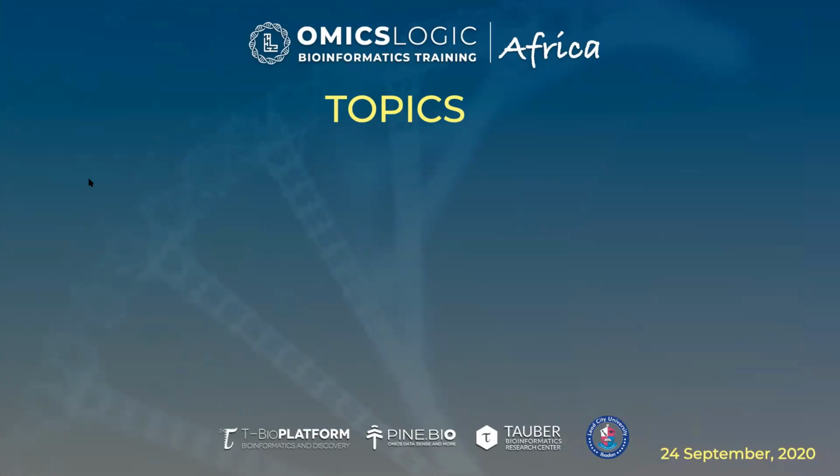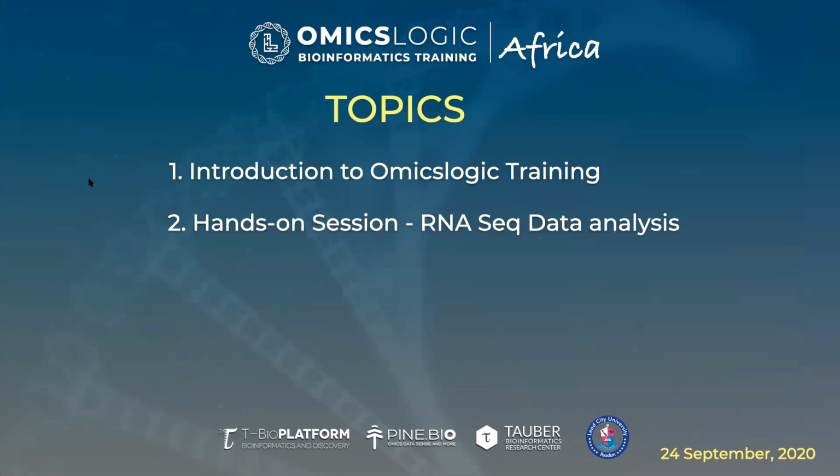So today we'll discuss the following topics. First of all, we'll talk a little bit about the OmicsLogic resources and different training platforms that will introduce you to bioinformatics. We'll also talk about breast cancer samples, an example where we can go from raw reads from the next generation sequencer and develop a table of gene and isoform expression. And that example will give you a snapshot of what this training will be all about.